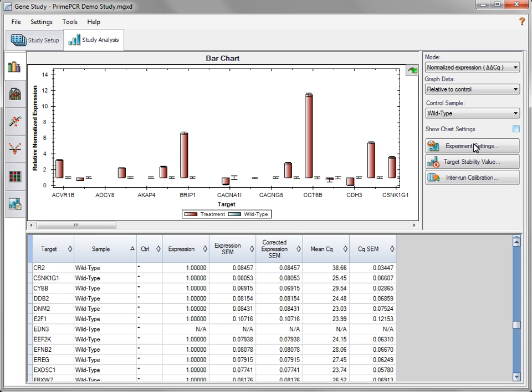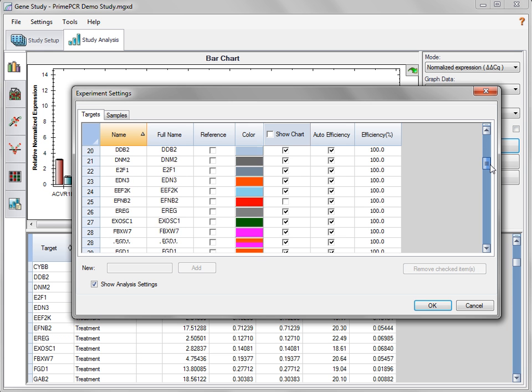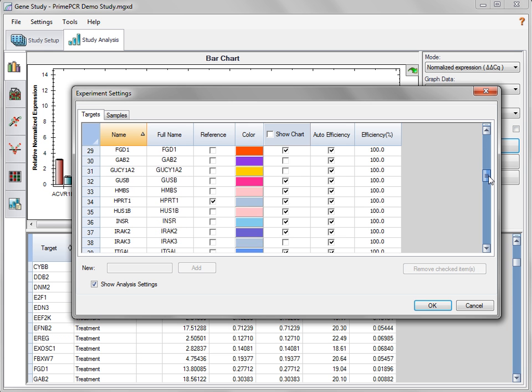There are additional chart settings available by selecting the checkbox. Select one or more reference targets that will be used to calculate normalized expression from the Experimental Settings window by clicking in the Reference column. If your PrimePCR plate contains any of the three reference targets included on pathway plates — GAPDH, TBP, or HPRT1 — these will automatically be selected as references by CFX Manager software.